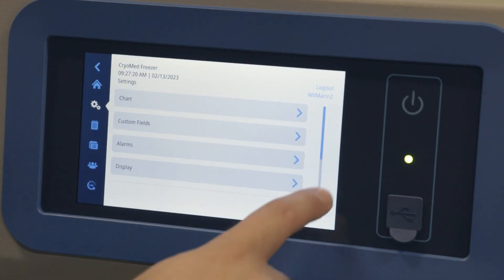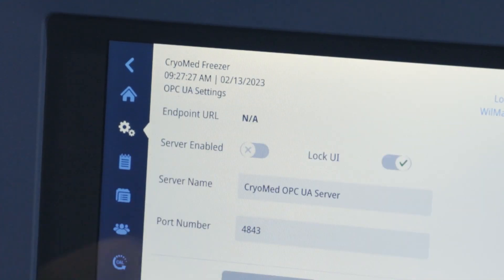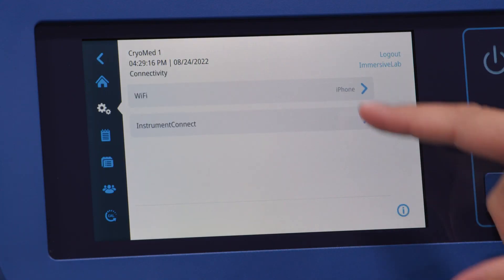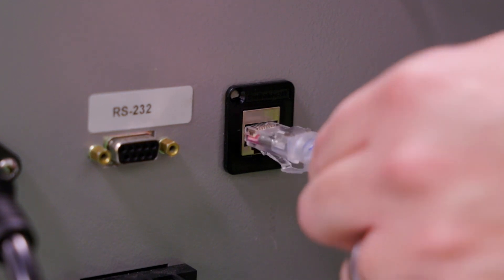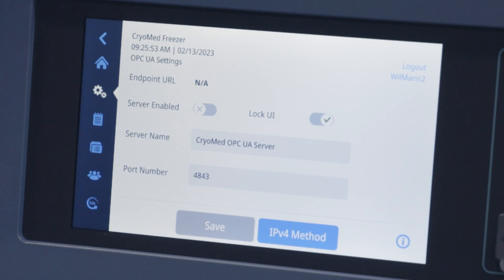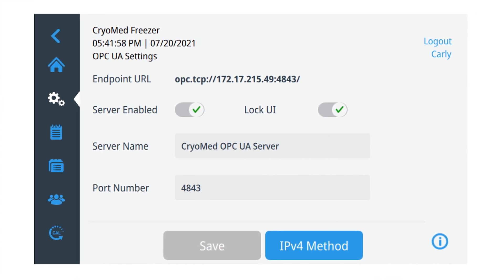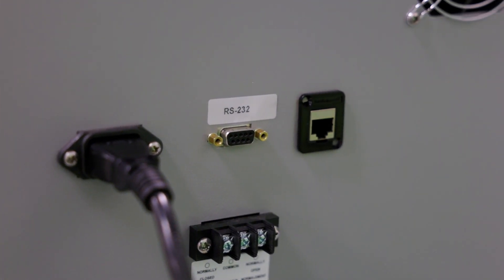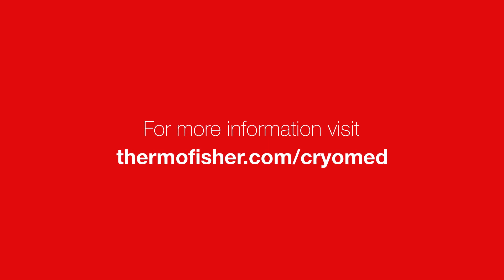To use the newest Open Platform Communications Unified Architecture functionality, return to the Connectivity button and enable the OPC UA interface. You will need to disable Wi-Fi in order to continue using the Cryomed as an OPC UA Server. You will also need to plug the registered jack or RJ45 connector and cable into the port on the back of the unit to support an Ethernet IP protocol. To enable the OPC UA Server, move the Server Enable toggle to the active position and press the Save button. Once the server is enabled, the endpoint URL will display the address of the OPC UA Server. This endpoint can be connected to an external OPC UA client on the same physical network. Wireless connections to this endpoint are not supported.